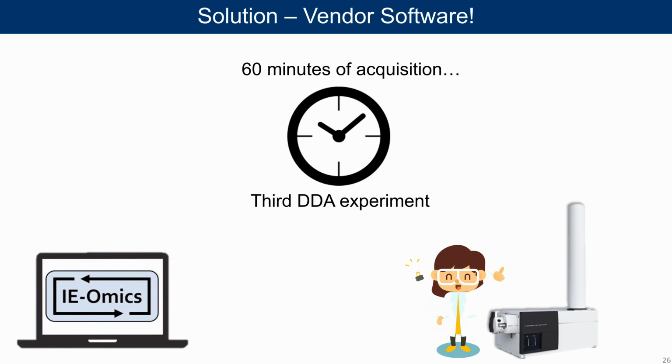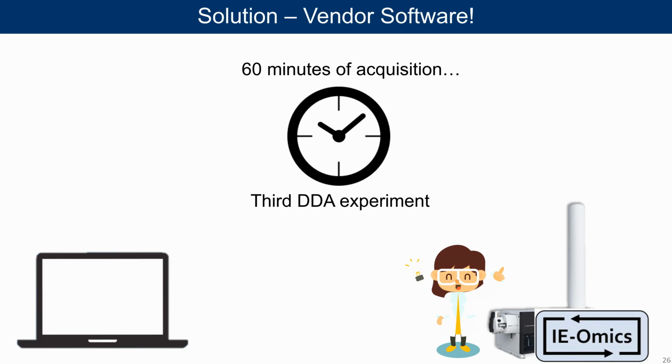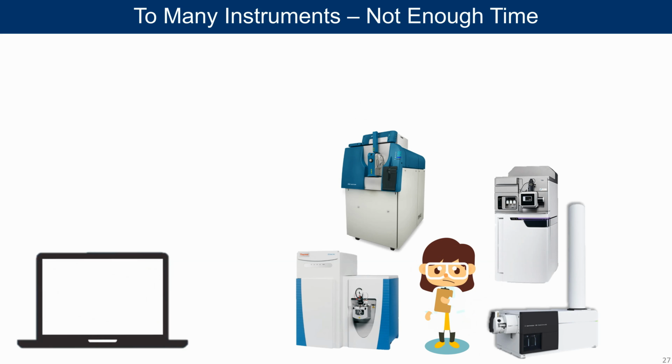Some of the instrument companies are now taking this work on. For example, Agilent has software very similar to IE-omics that pretty much does the same thing, whereas Thermo, we know, has IDX, and other vendors are also creating their own iterative acquisition approaches. That can be advantageous, but many instruments still don't have these techniques. And for researchers, it would be very beneficial if we had an open source platform that we could continue to improve that works on all vendors.